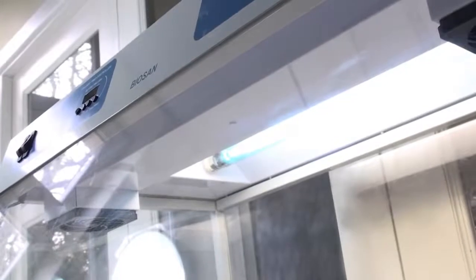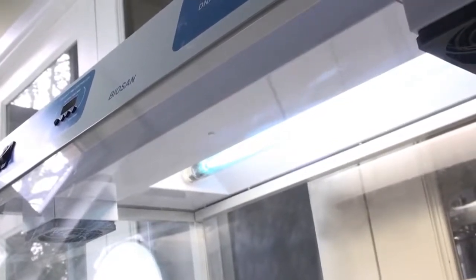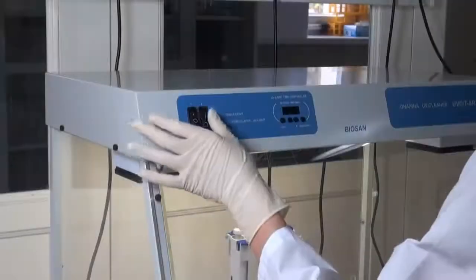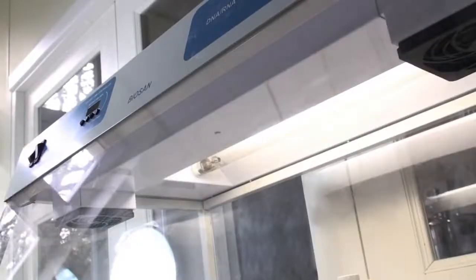UV Cabinets are equipped with an open UV lamp installed in the upper hood. UV radiation from the open lamp disinfects the working area by inactivating DNA-RNA fragments during 15-30 minutes of exposure. A digital timer controls duration of the direct UV irradiation, and a daylight lamp provides proper illumination of the working surface.